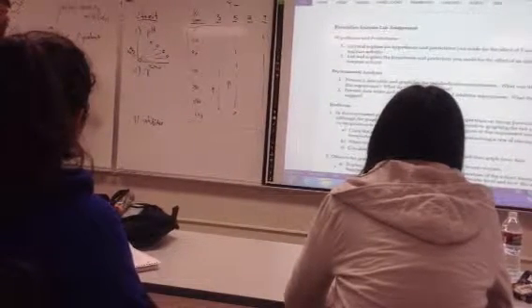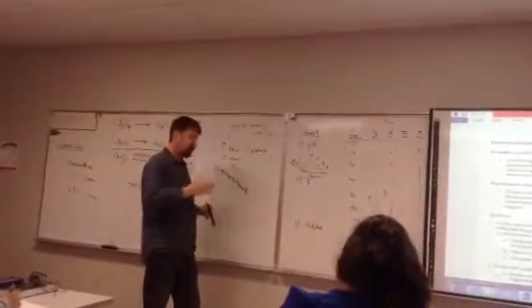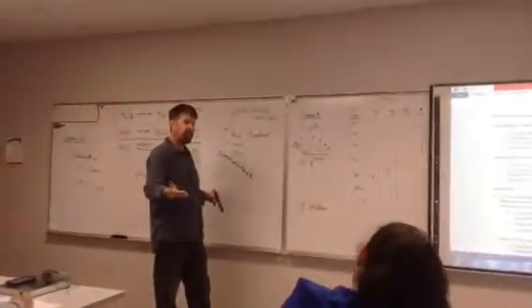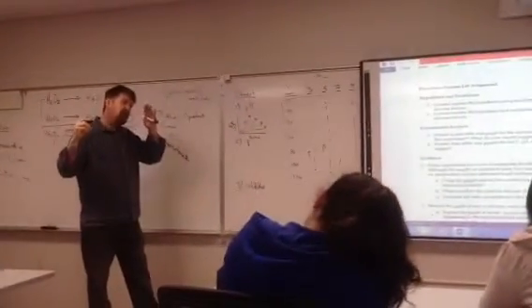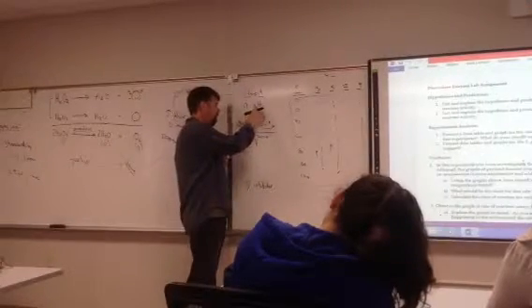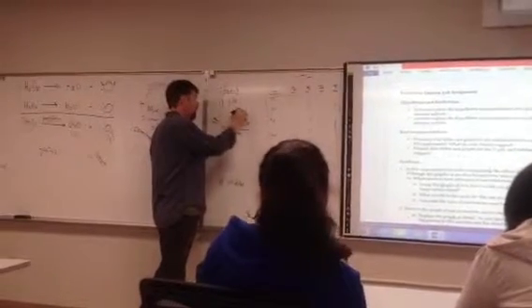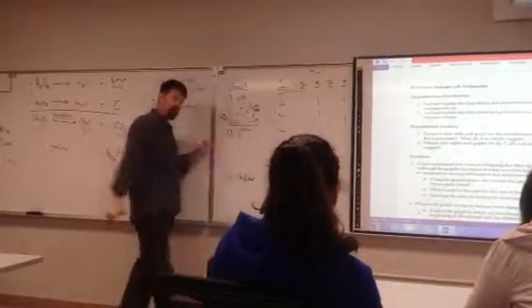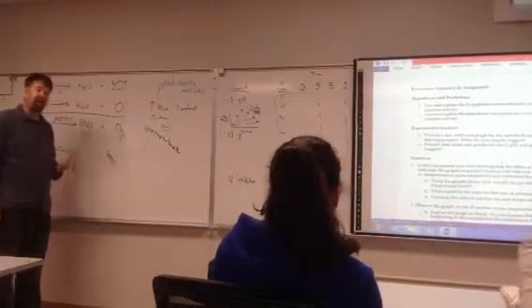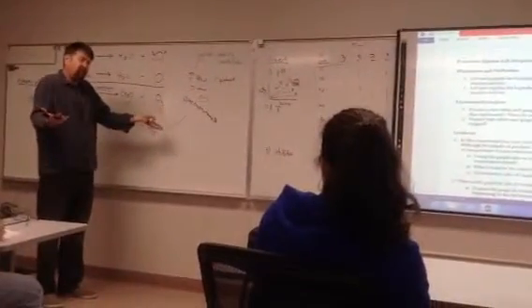And obviously, the real piece of information that we want is the rate of the reaction, right? And a rate is something changing over time, right? So as Ting Ting mentioned, it's the slope of that line. So the rate of the chemical reaction at 5 is the slope of this best fit line at 5, and so forth. And the units are going to be change in optical density units, per second probably is how it would come out. And that's the rate. And obviously the one with the highest rate is going to be the optimal. Kind of makes sense, right?